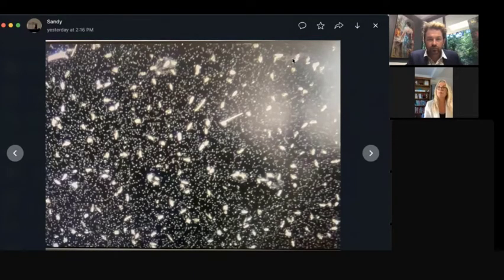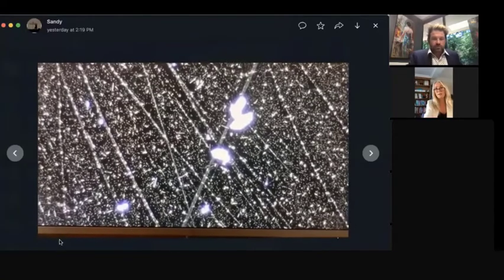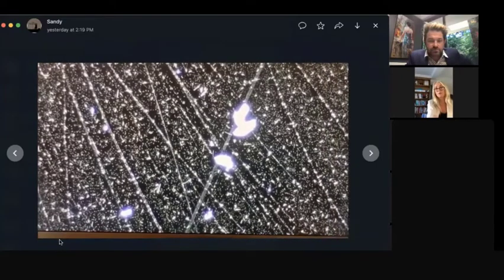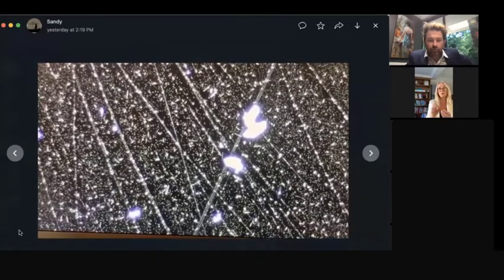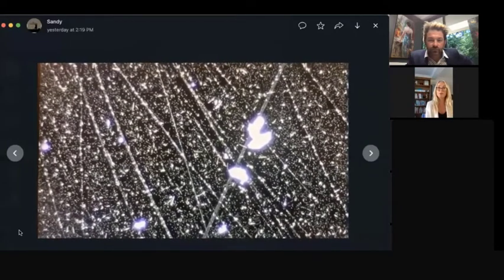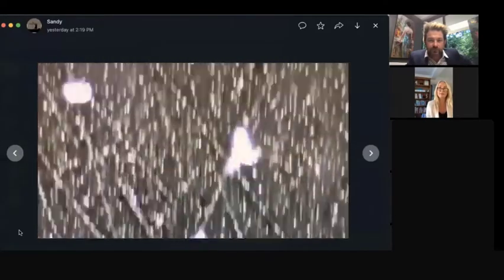And when I went back to it about 3 or 4 hours later, I noticed that it had formed its own lines. It's like they had some kind of intelligence. I've never seen this before. And you can see all these lines had developed, and all the zeolite crystals were on the lines. I mean, there were some just slightly outside the lines, but I think in the video when I'm showing it, you can see how they like to be on the lines. It was quite incredible. So you just follow the lines and they would be, can you see?